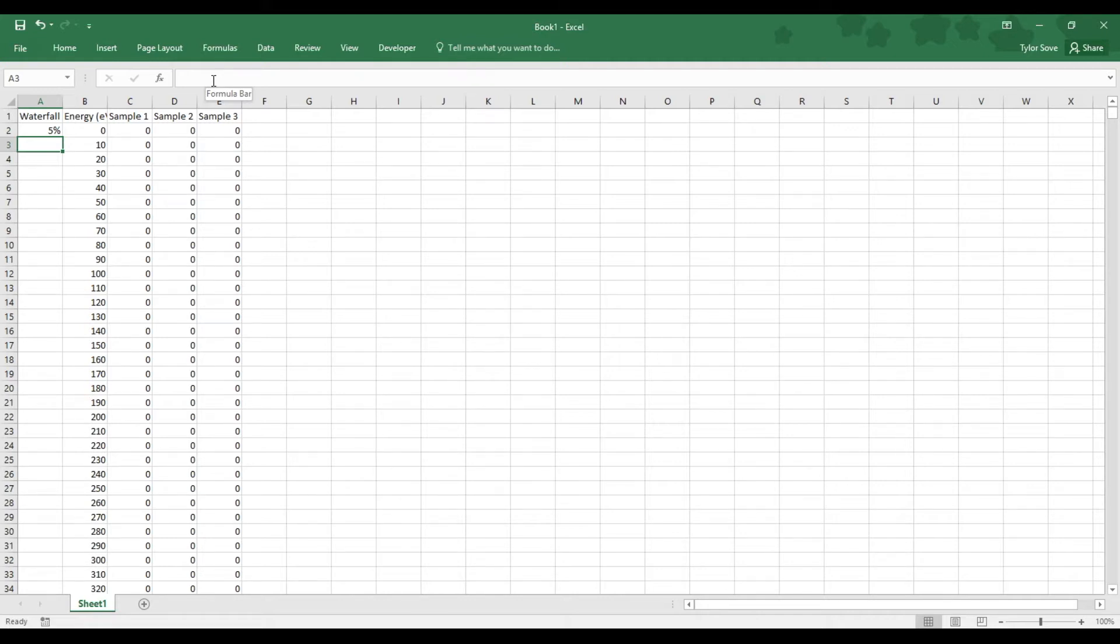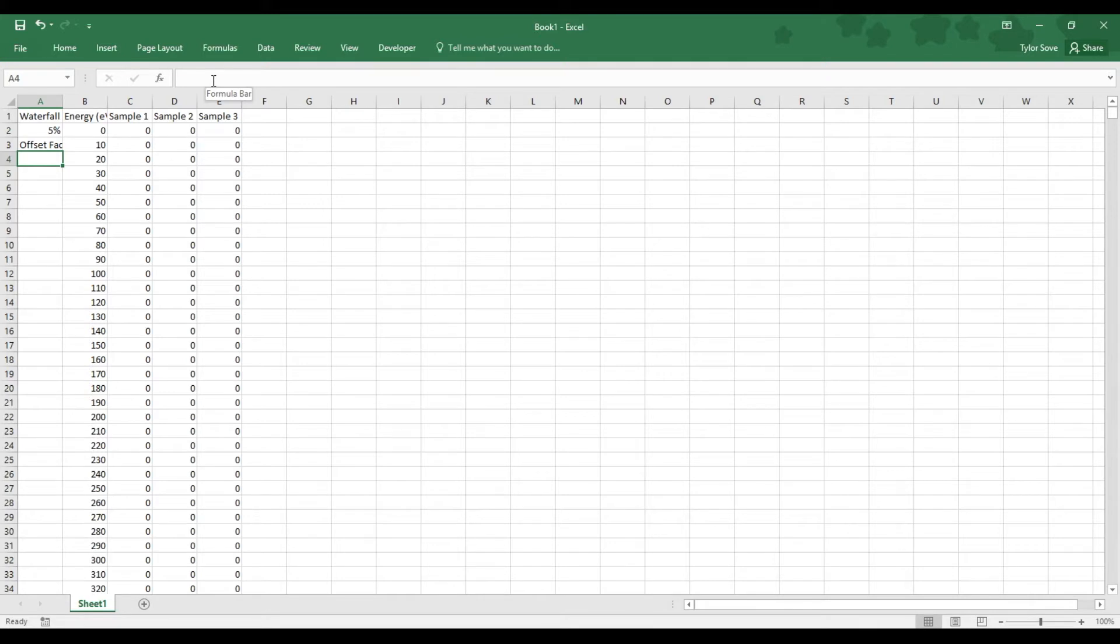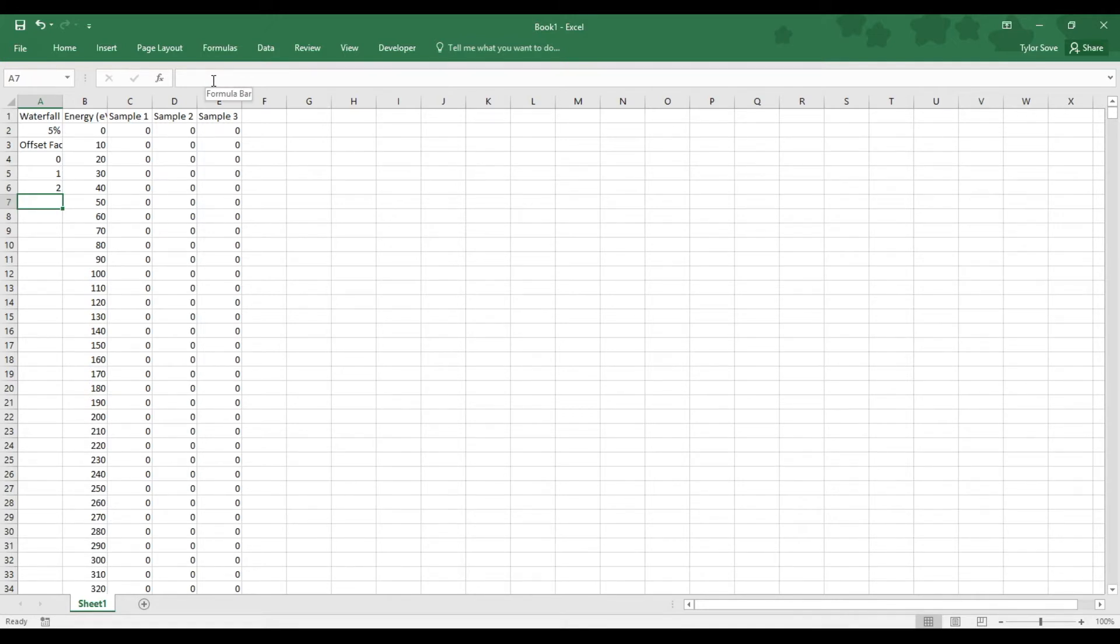Now in cell A3, type in offset factor. In cell A4, A5, A6, and so on, start by typing 0, 1, 2, and so on and so forth until you have enough numbers for the total number of samples that you have.